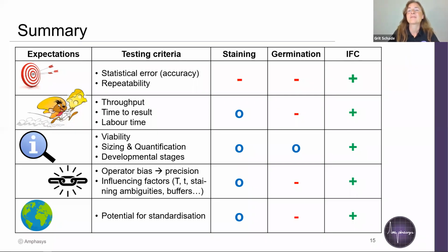There came in a general question: is there a correlation between lab testing of pollen viability and pollen viability during the pollination? Again, I didn't understand your first part, excuse me. Is there a correlation between lab testing pollen viability and pollen viability during pollination?